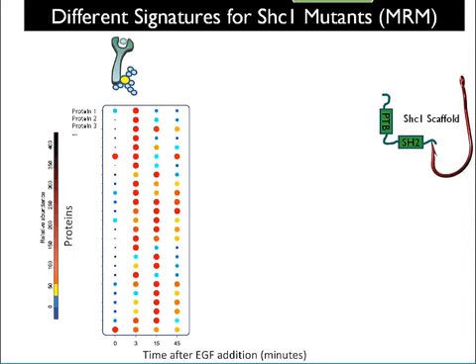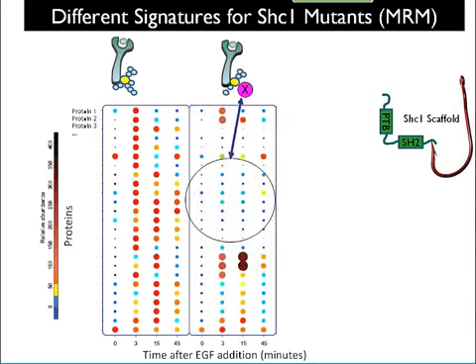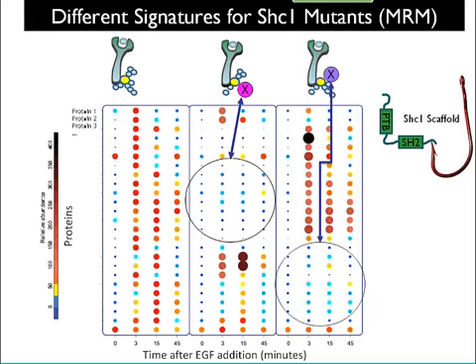But what would happen if in this particular instance, Shc itself was mutated so that part of what it binds to stopped binding to other proteins? So here's a schematic of that. You can see the middle pane. We've knocked out part of the Shc complex. So the middle group of proteins is no longer associated with Shc. And furthermore, we can do another mutation of Shc and show that we can knock out a whole other set of proteins.